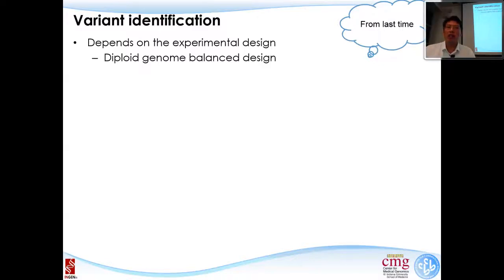And once you have a decent amount of coverage, that should be an easy case for figuring out what the variants are. We discussed that topic, and we mentioned that normally we want about 30x coverage to reliably detect most of the variants. But we also discussed 2 possible ways to increase the identification power. The first way is lumping multiple individuals' variant identification together, like what they did for the 1,000 Genomes case.